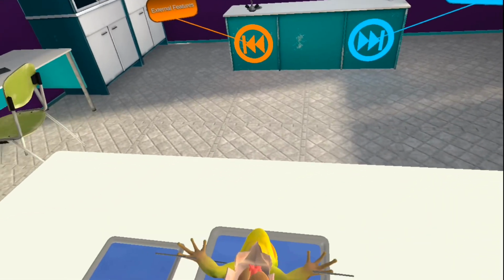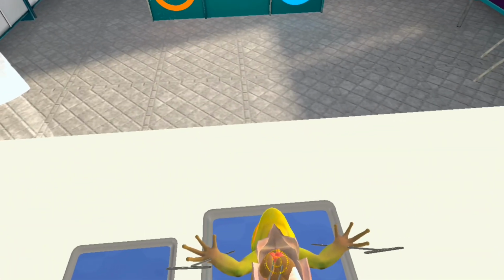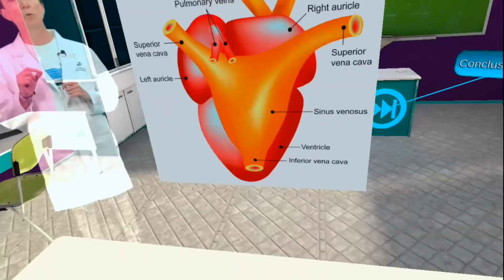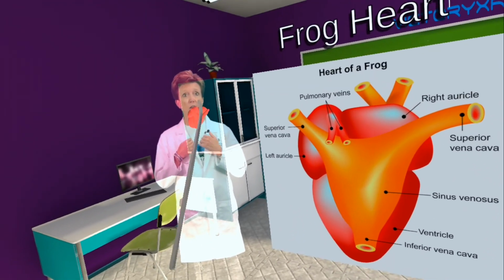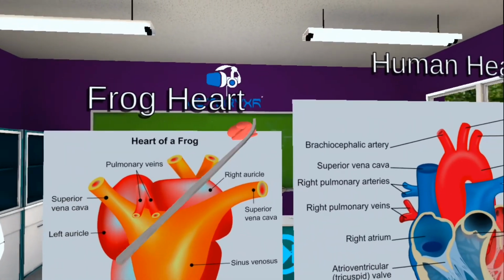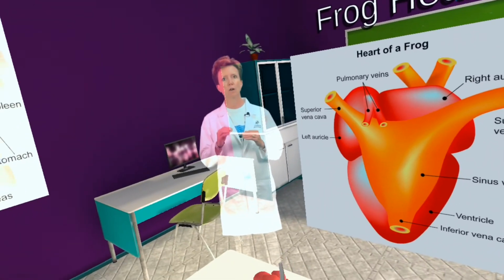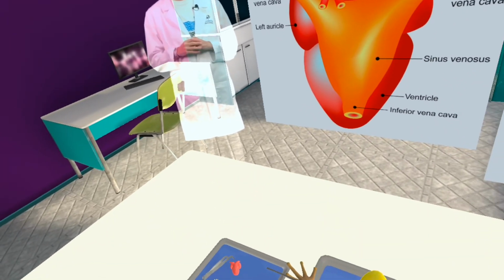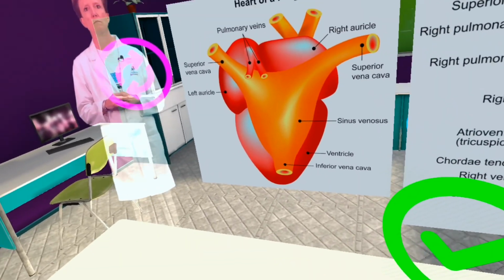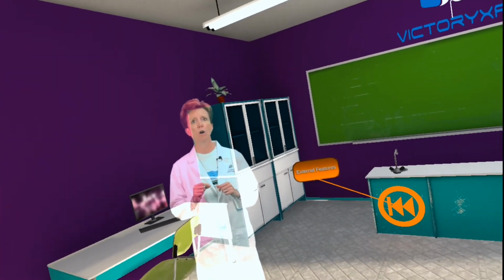Anyway. Now let's start looking at some of the major organs. The frog's heart is the small triangular organ at the top. Unlike a mammal heart like yours, it only has 3 chambers, 2 atria at the top and 1 ventricle below. Carefully remove the heart with the forceps. Done it. Go ahead and place it next to your frog. Also done.